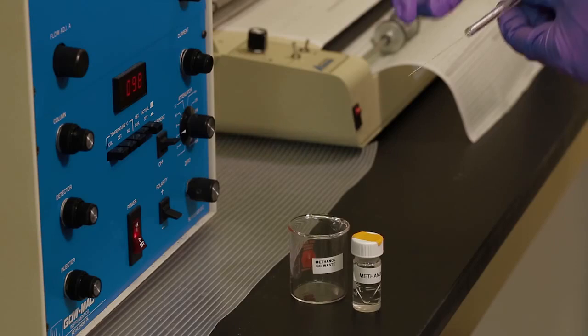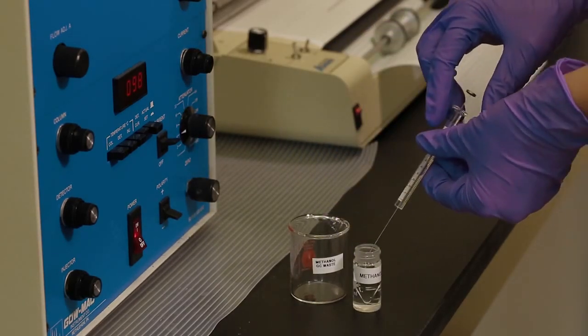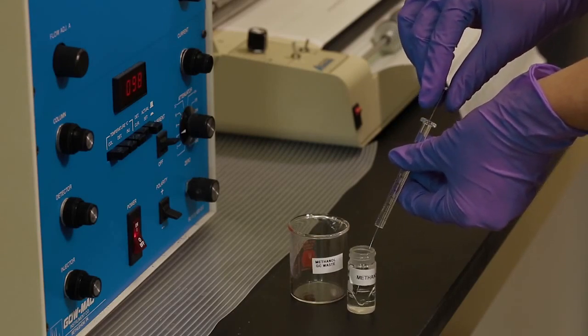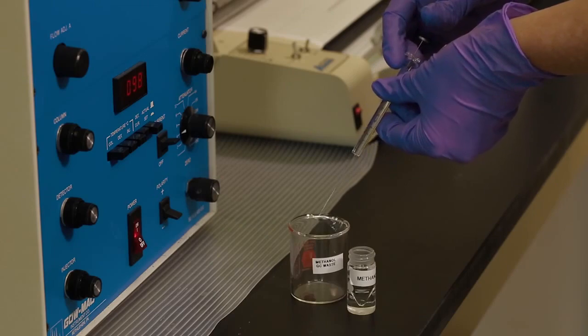When the sample runs through the column, clean the syringe that you used to inject your sample. Pull a solvent such as methanol into the syringe, then empty it into a waste container to clean it of any remaining sample.